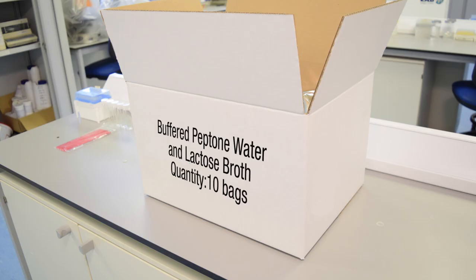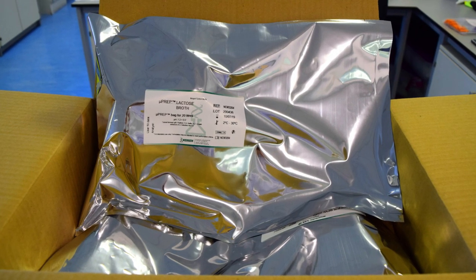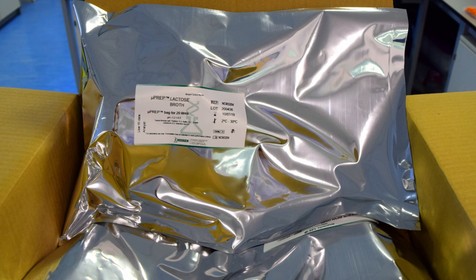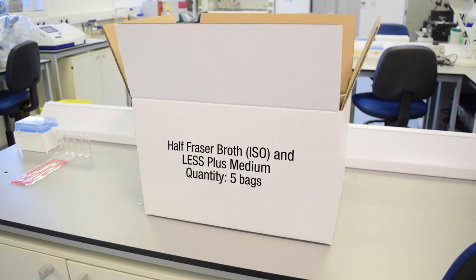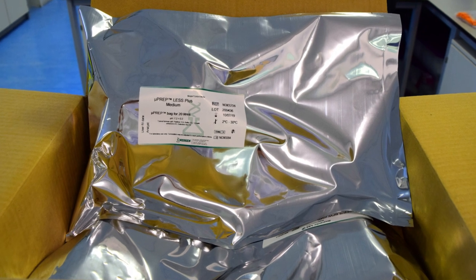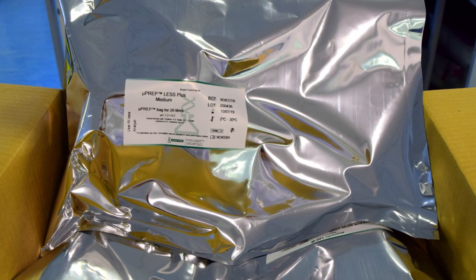BPW and lactose broth come in boxes of 10, with individual MicroPrep bags hermetically sealed in foil single-use bags. Half Fraser broth and LesS Plus have the same packaging, just 5 bags per box due to the volume of dehydrated culture media within each bag.